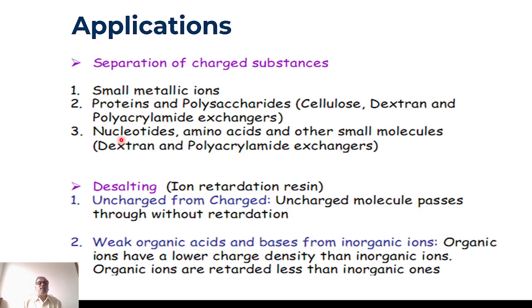The only thing is your molecule should carry some charge. That's all. If it is neutral, try to use some biochemical or chemical reaction to impart some charge. Neutral molecules cannot be separated. So the main mandatory requirement is that only charged species can be separated using this chromatography. Separation occurs because of charge, not because of size or weight. So that really doesn't bother us.